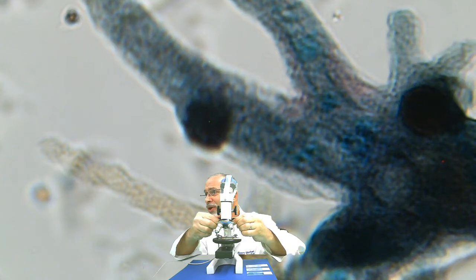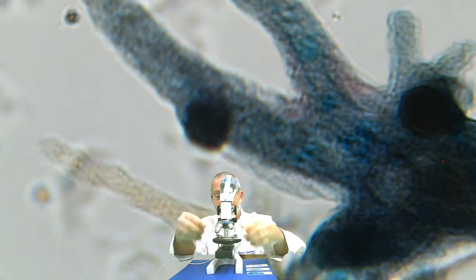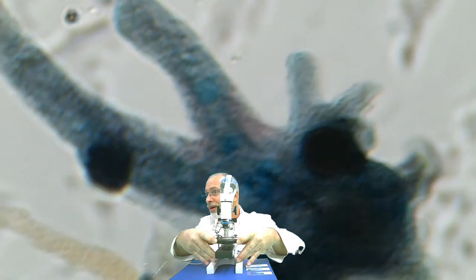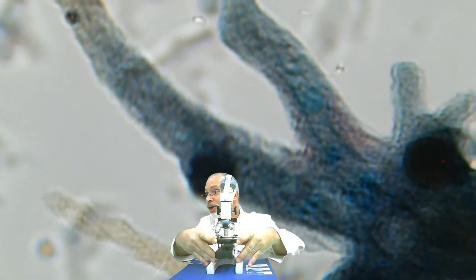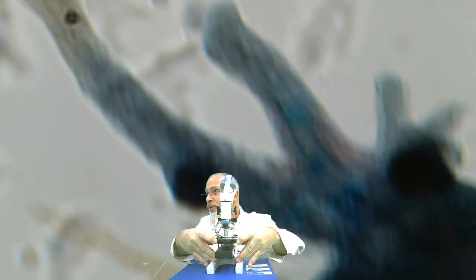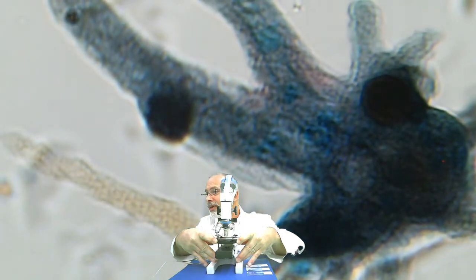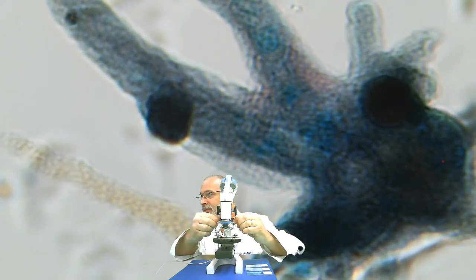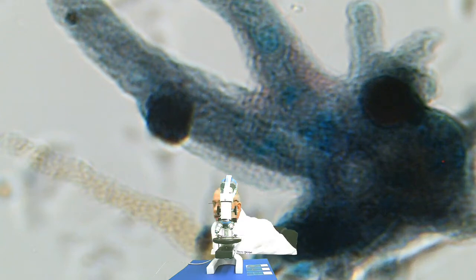We can't even see the whole thing on the screen at 100 times magnification because they are so, well, relatively large. But let's stick with this view here. There we go. Let me get this into focus, and then you can take some time to illustrate what you see, and this is 100 times magnification of an amoeba. So pause the video now for your illustration.